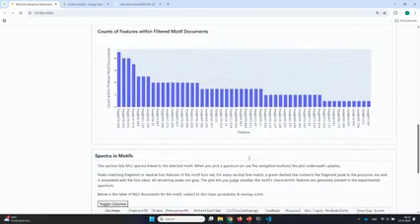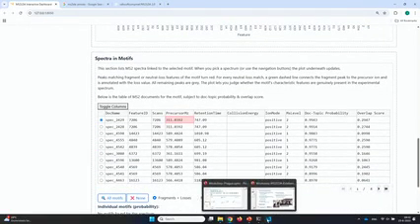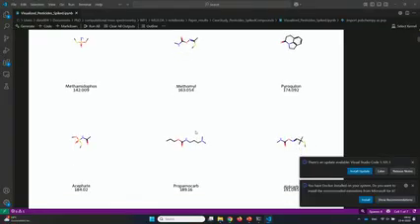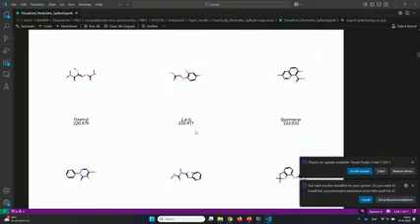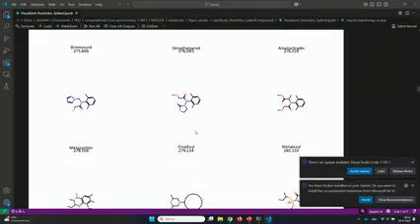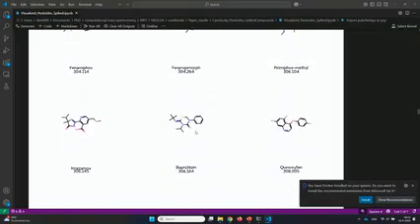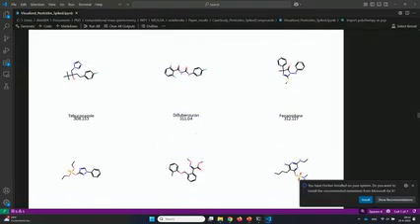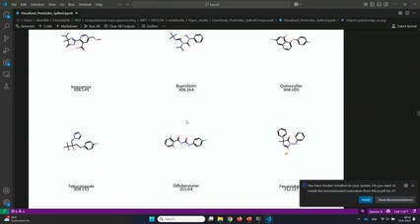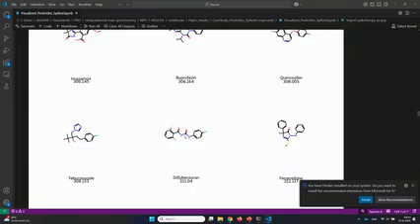And if you would have told me now, okay, I have those and those precursors, does that make sense? I have here a list of all the spiked compounds. And then that was 311. And we are really close, yeah. And you can see 311, there is, okay, can't zoom in. This represents this structure, the difluorbenzeron, and it has exactly the substructure.